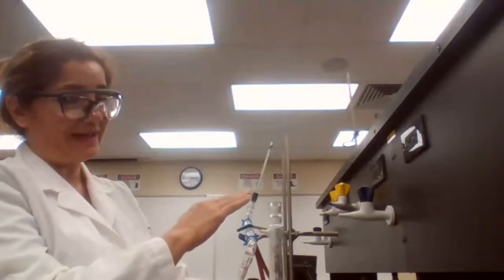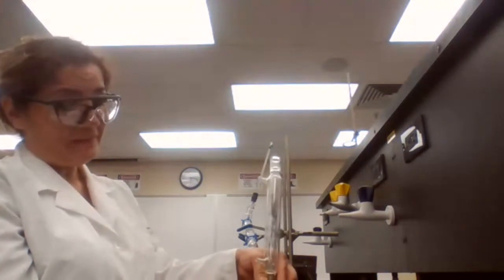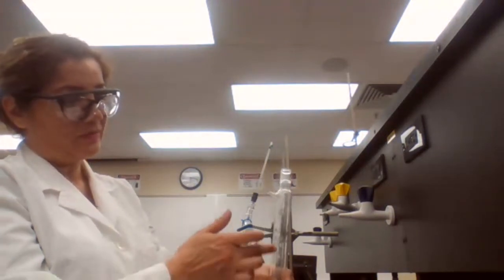When all the vapor A is gone, then theoretically only the compound B is left in the flask, and B starts vaporizing.